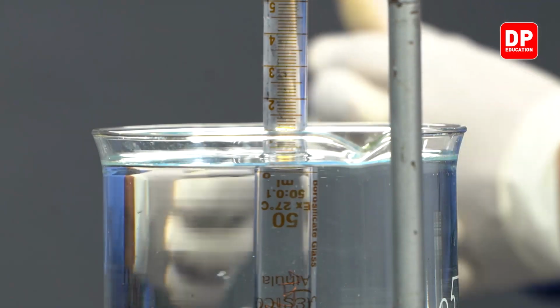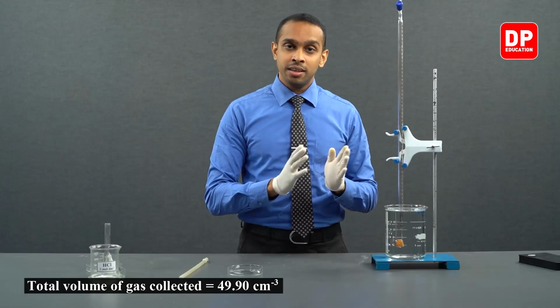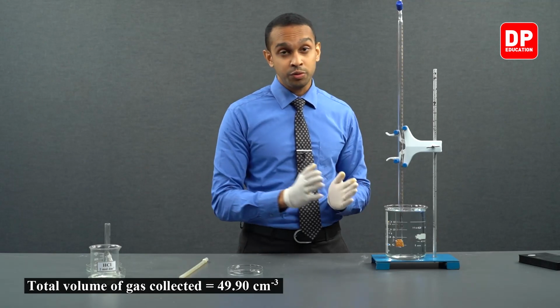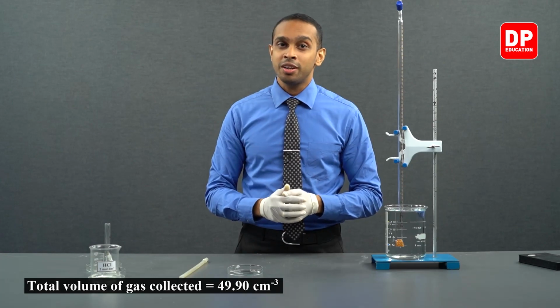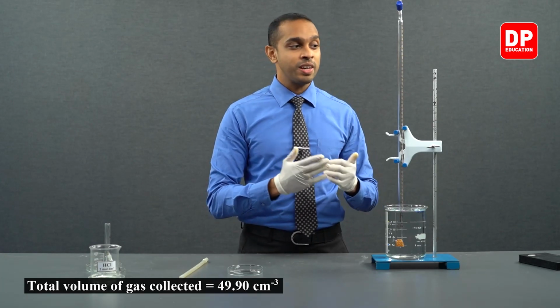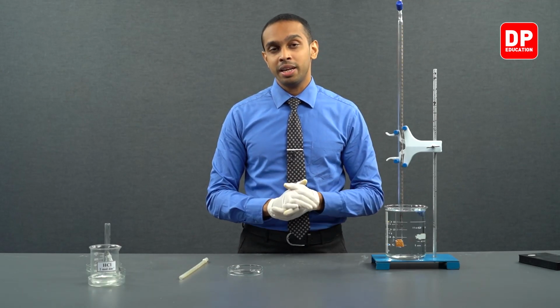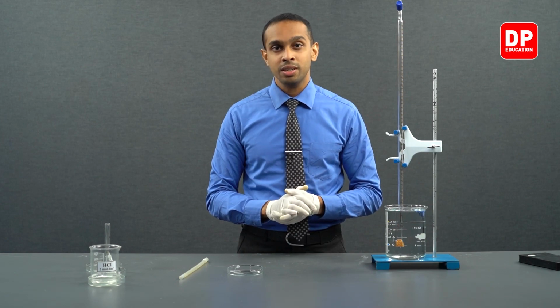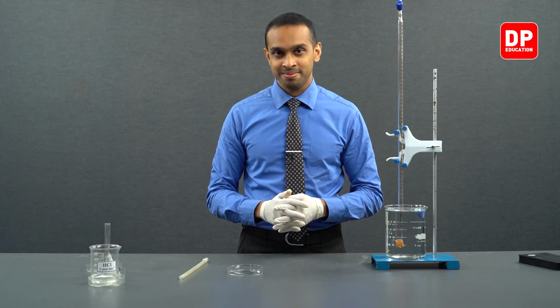The current reading is at 49.9. Earlier, when it was submerged, it was at 49.8. Now it is going to be 49.9, meaning we have collected exactly 49.9 milliliters or cubic centimeters of hydrogen gas at 1 atm pressure.